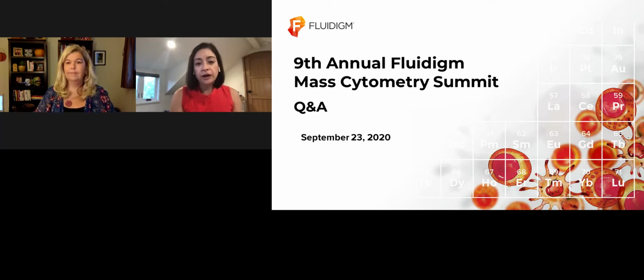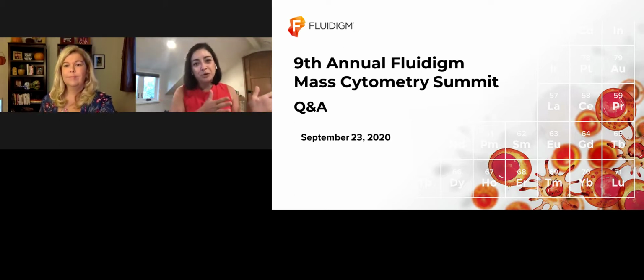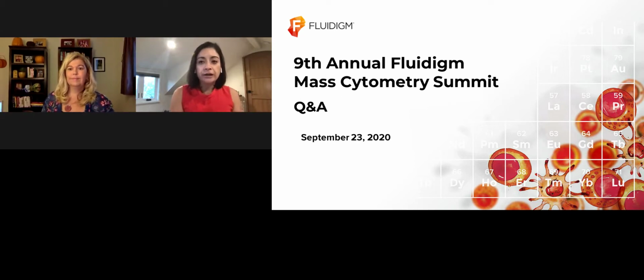And then we also now run a CD22 trial at Stanford. So we've taken a look at some of those samples as well. That data analysis is certainly a little bit more immature, but we're looking to integrate some of the observations we're making with CD19 along with the CD22 samples, because we have also observed clinically that after CD22-targeted CAR, it is very common for patients to drop the level of CD22 when they relapse. So it's an antigen that almost seems even more susceptible to pressure. So stay tuned. Thank you so much.